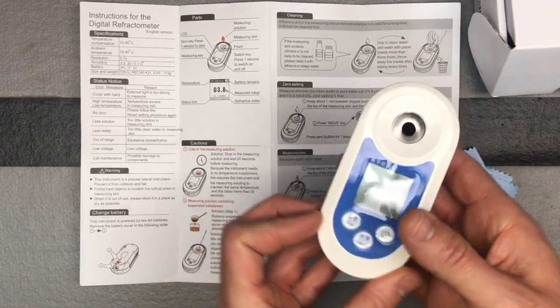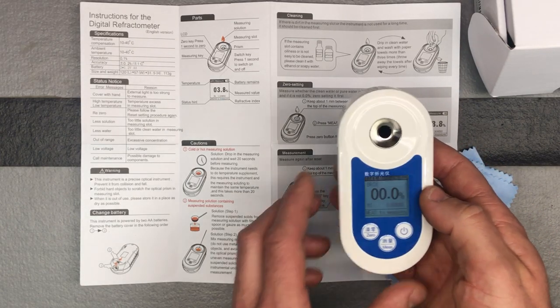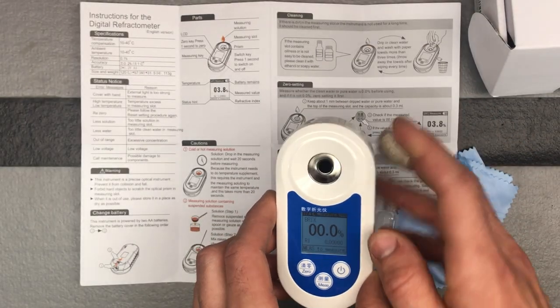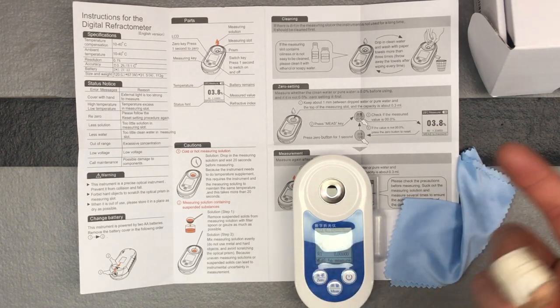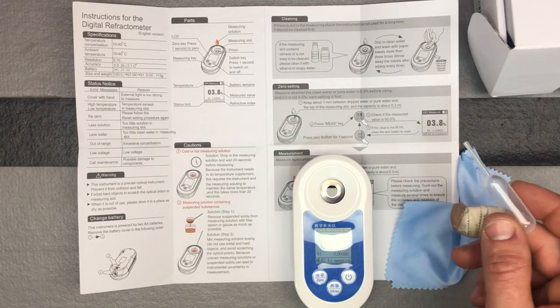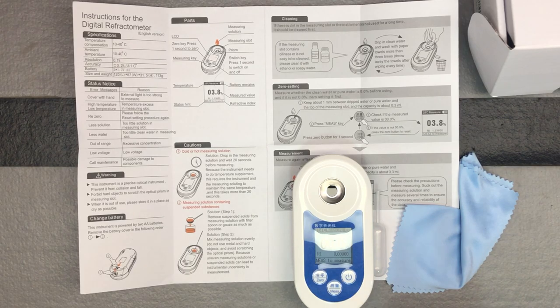The battery is clicked in and we're ready to go. When you power it up, you can see the Brix reading, your ambient temperature, and it prompts you to press measure. You can also zero it out. The key tip is to drop the solution in here and wait 20 seconds before pushing measure, because the instrument is calibrating based on ambient temperature and the liquid temperature. Make sure you wait those 20 seconds, then push measure to get your reading.